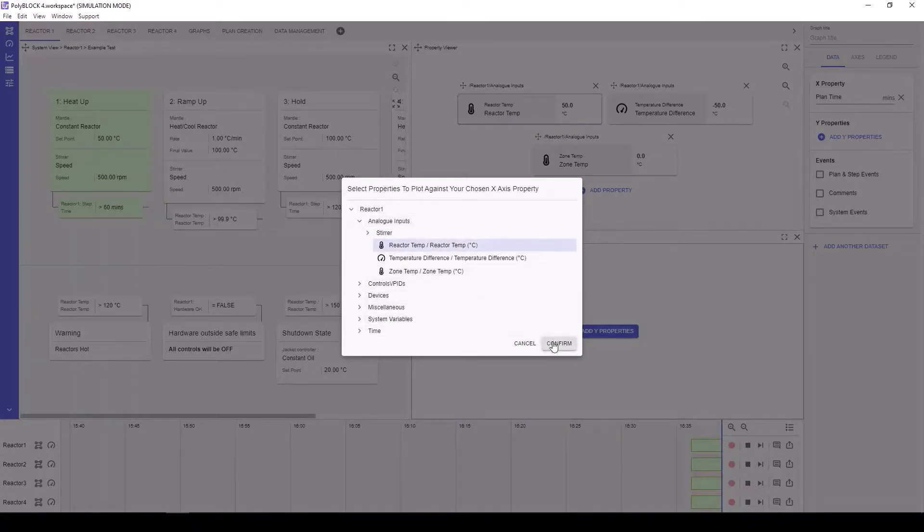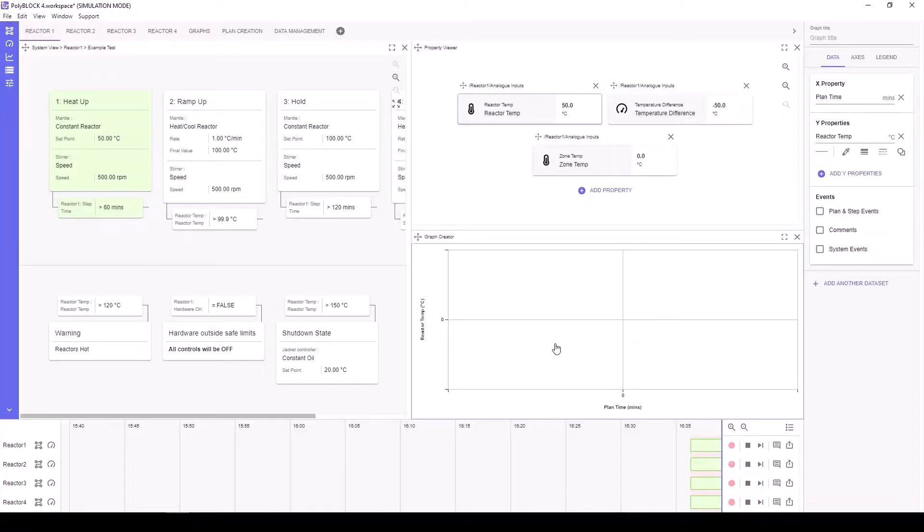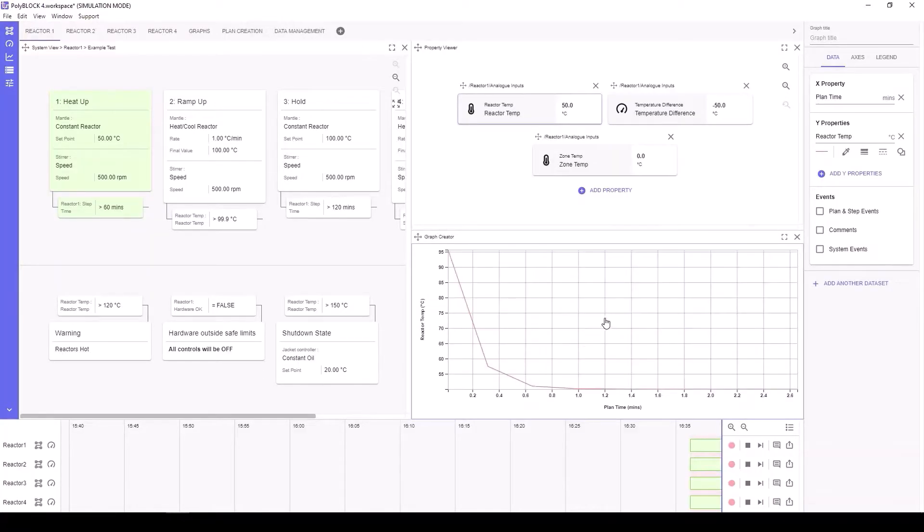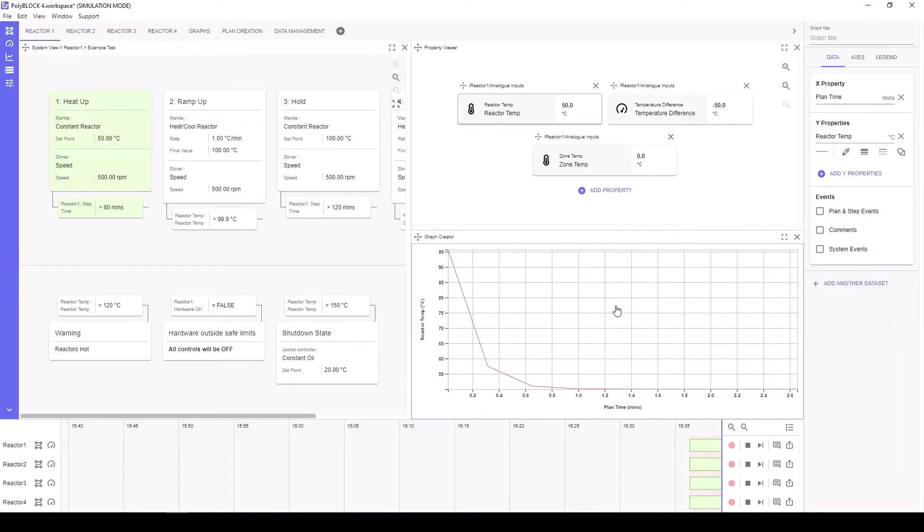Multiple datasets can be plotted on the same graph, but this will be demonstrated later. Here, we select Reactor Temperature and the graph is instantly updated with our request.